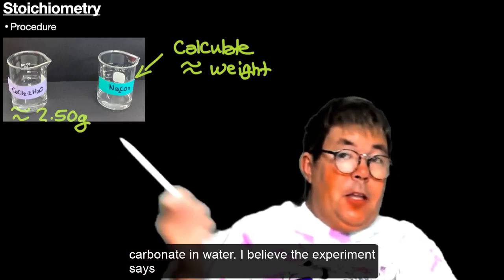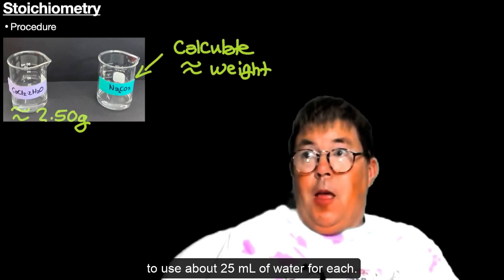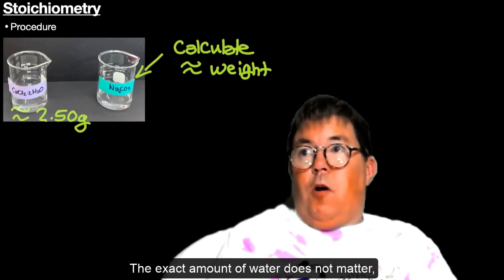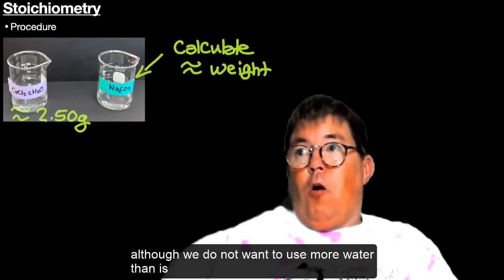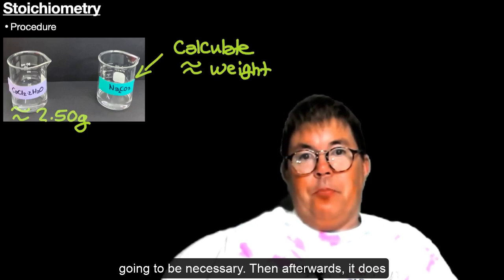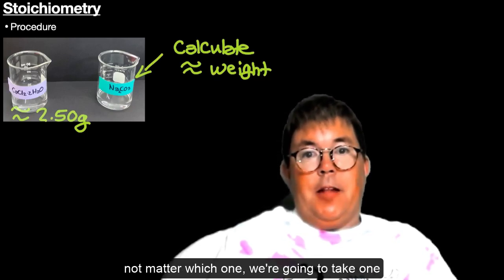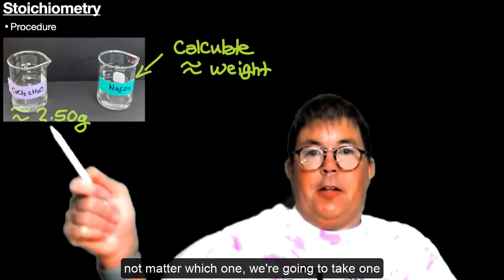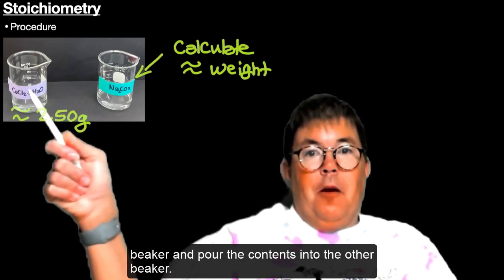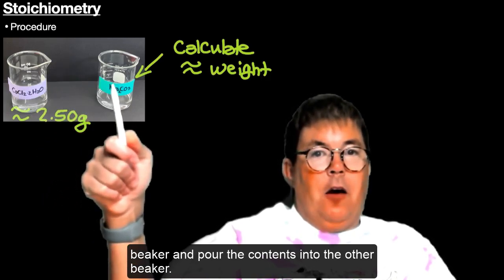I believe the experiment says to use about 25 milliliters of water for each. The exact amount of water does not matter, although we do not want to use more water than is necessary. Afterwards, it does not matter which one, we're going to take one beaker and pour the contents into the other beaker.